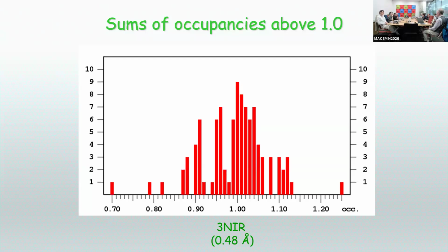Now, I remember that from the time when I was working on neutron diffraction. And there, if you want to refine the occupancies of hydrogens, you have hydrogen and deuterium, they have opposite signs. So you refine occupancies and everything is fine. I found that if we just tried to do the occupancy refinement on the labile hydrogens, all the errors were in there, and that was nonsense. But if we let all the occupancies of all atoms vary, it spread the errors sufficiently that the numbers for particular type of atoms were believable. But that is clearly a trick of refinement.